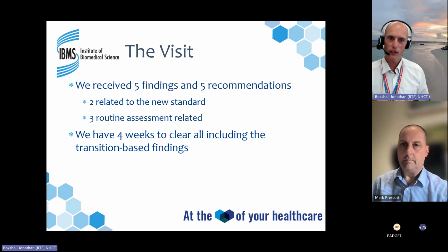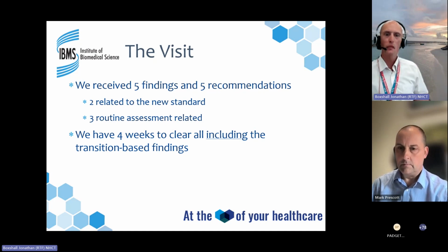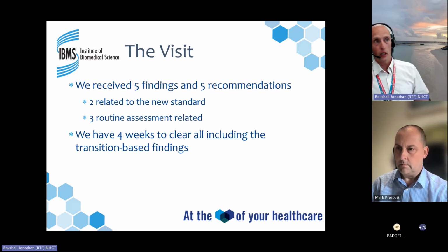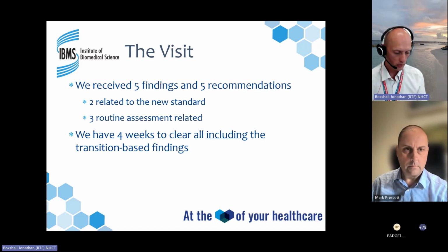As you know, this is a sampling exercise, and there may be non-conformity elsewhere, and just because we haven't found it doesn't mean it's not there. But what's key and important for me, as a technical assessor, when I get the evidence back, is the cause and extent.